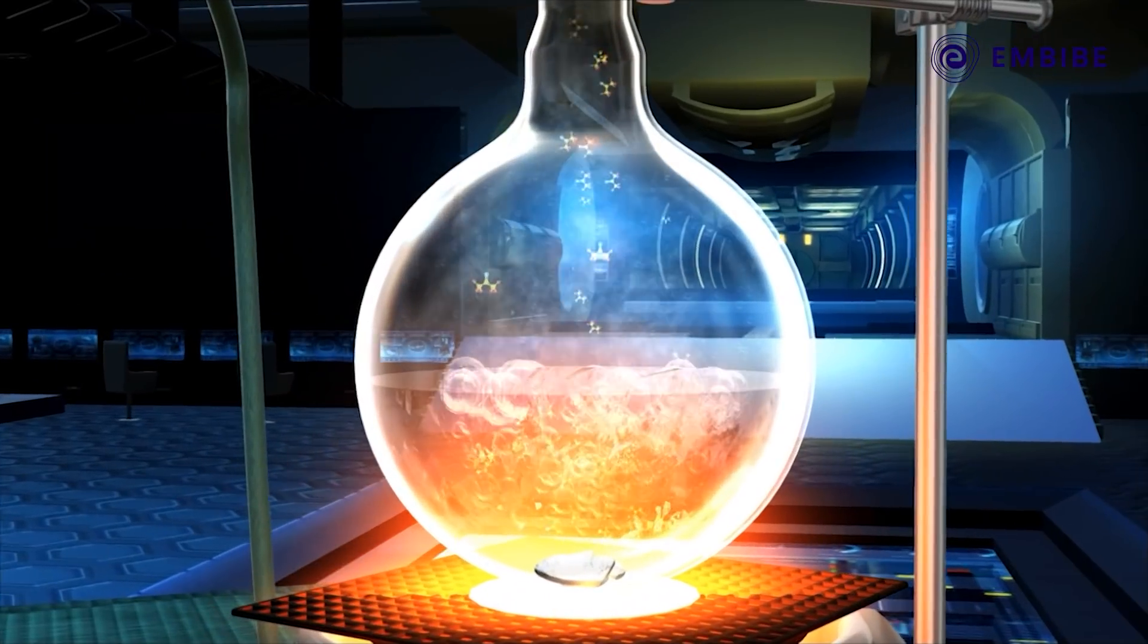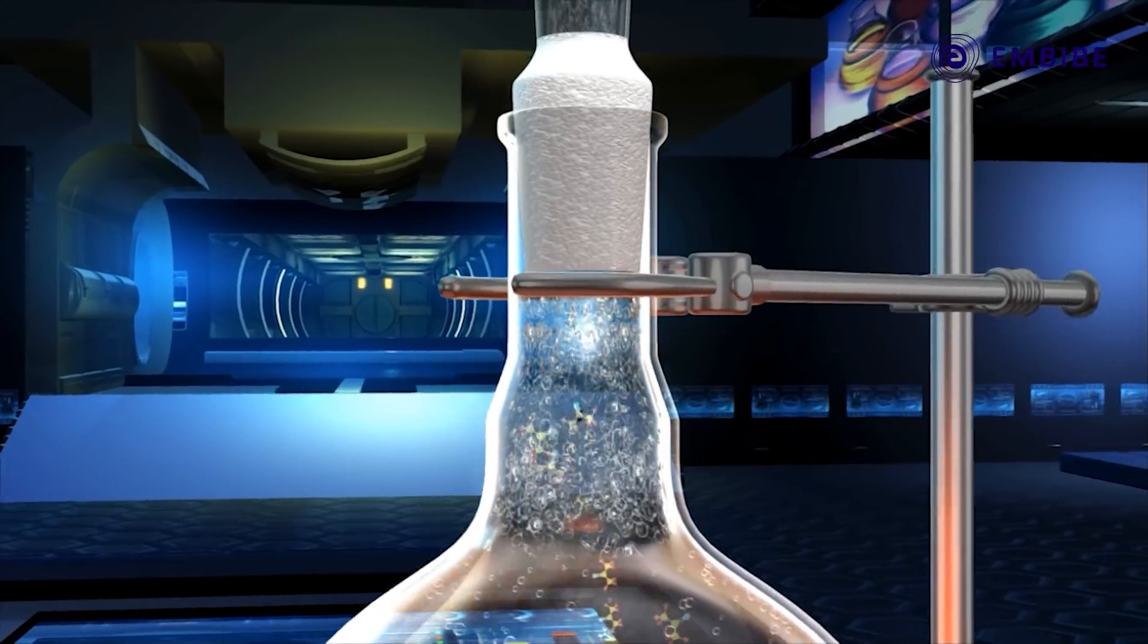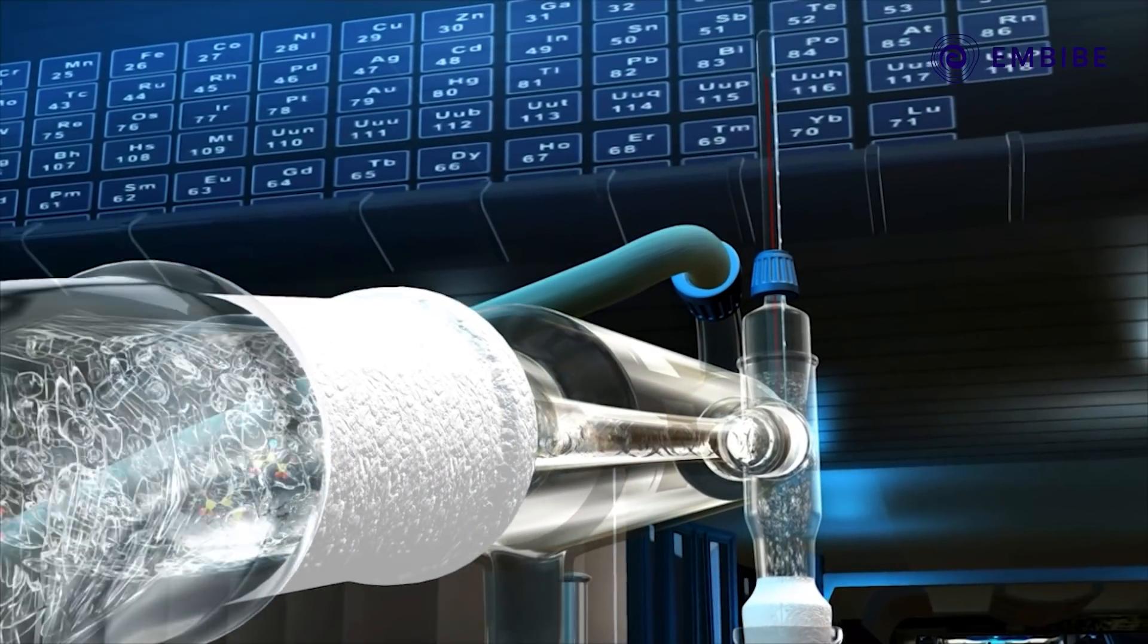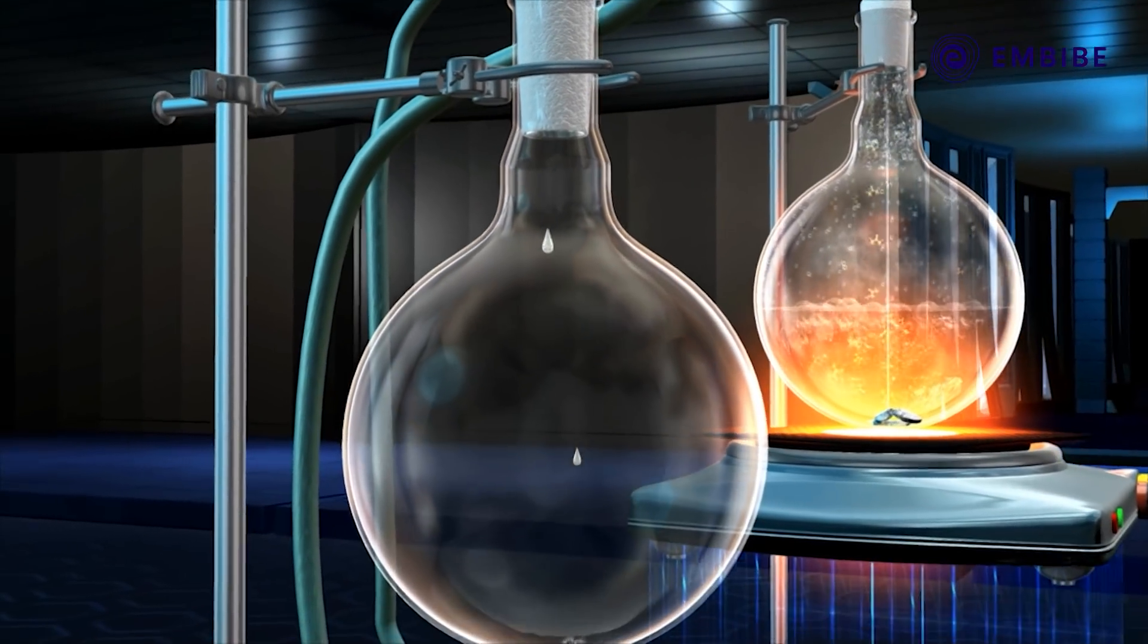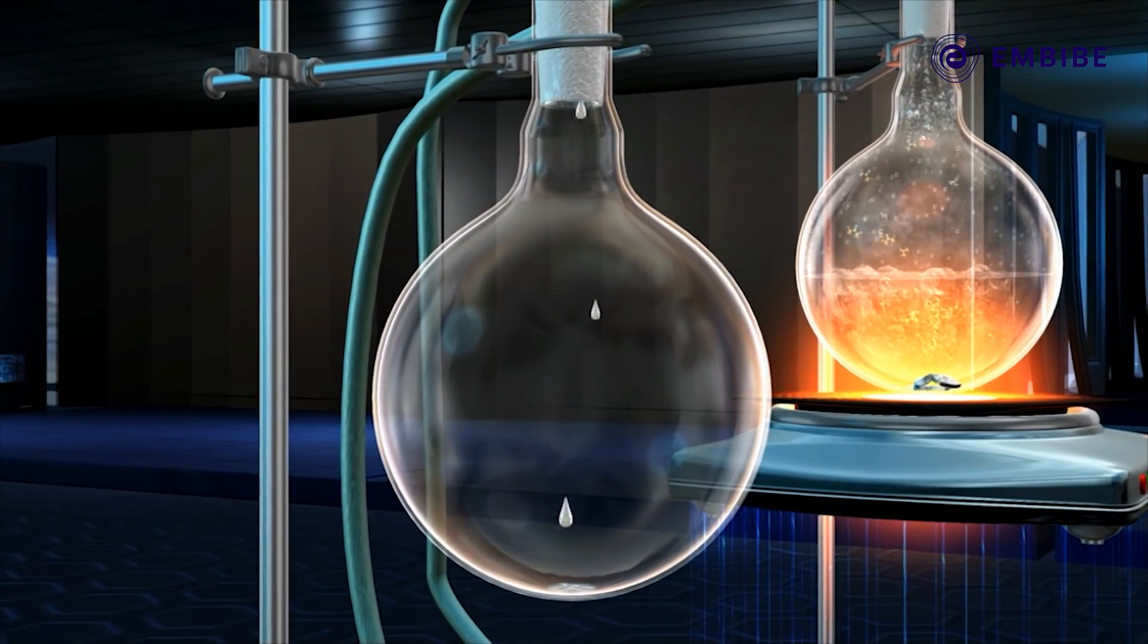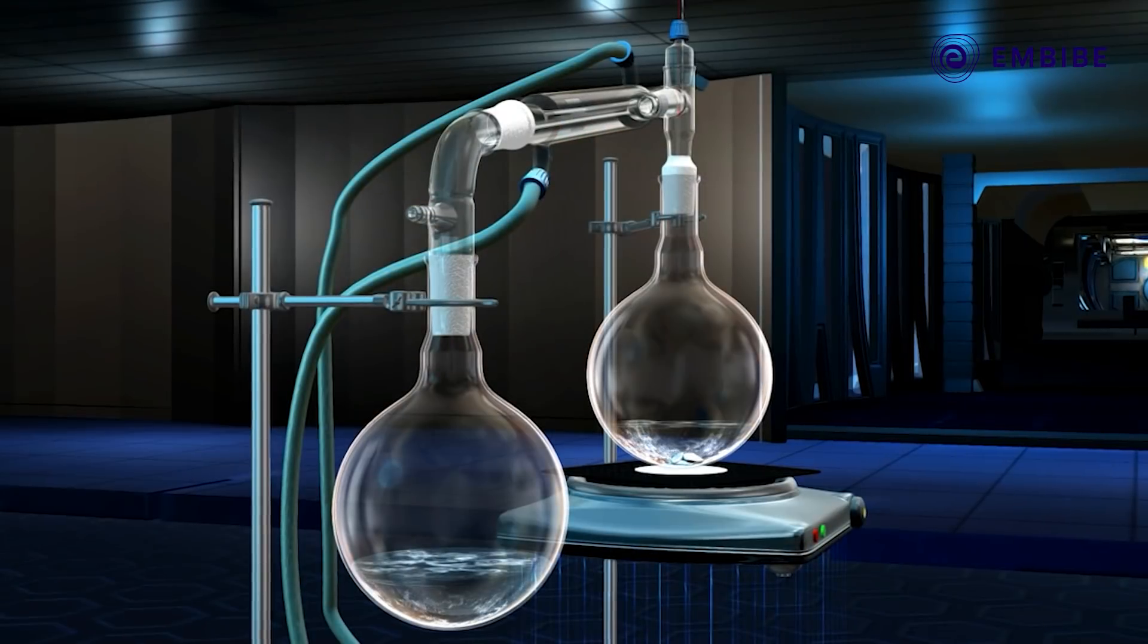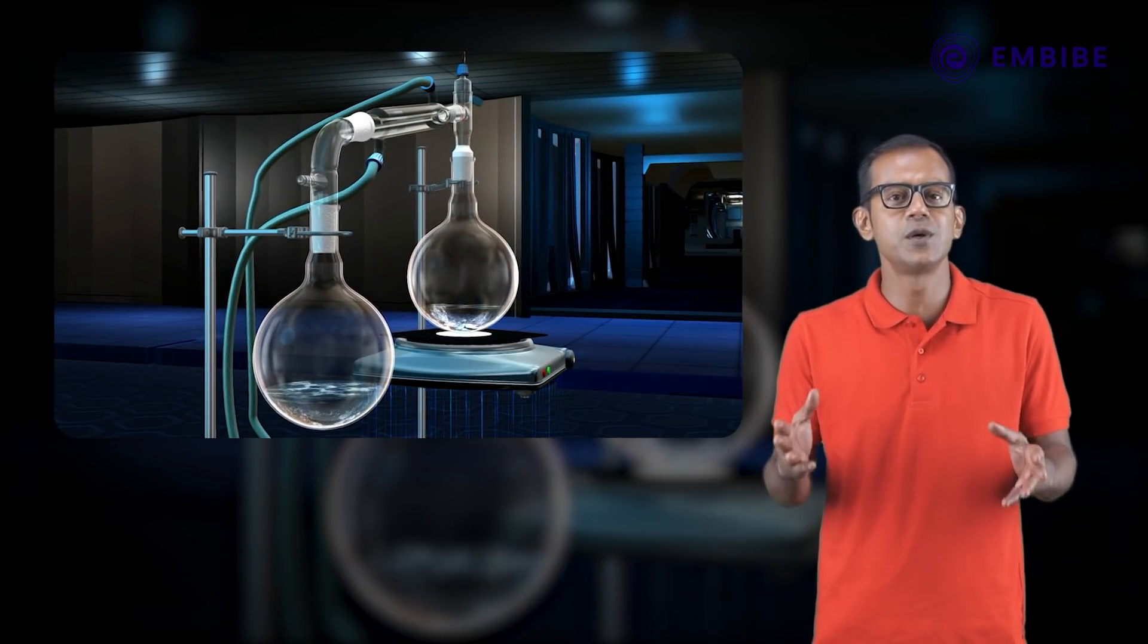Till all the acetone vaporizes, the temperature remains constant at 56 degrees centigrade. The vapor of acetone enters the inner tube of the condenser where it slowly cools and condenses back into droplets of acetone. This acetone is then collected in the receiving flask.